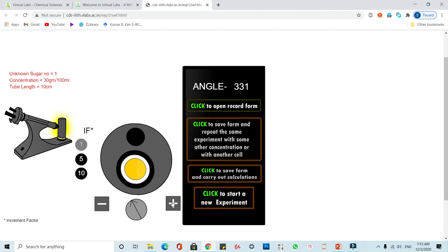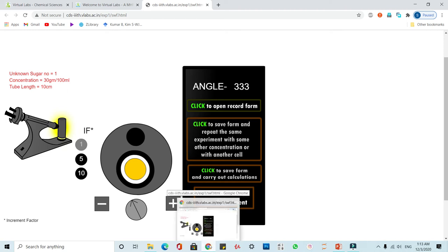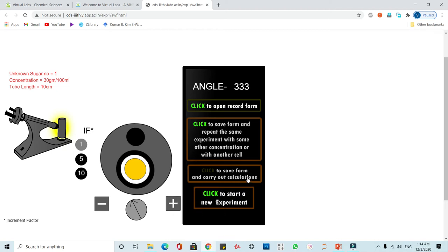Okay, I have made the table. In the clockwise direction, the value is 1. The two regions become completely bright at 153 degrees and 333. But in a single experiment, it is not possible to tell the actual value of the total rotation.